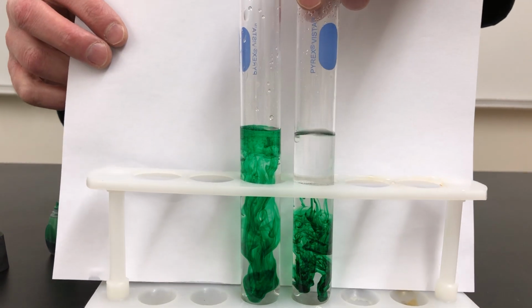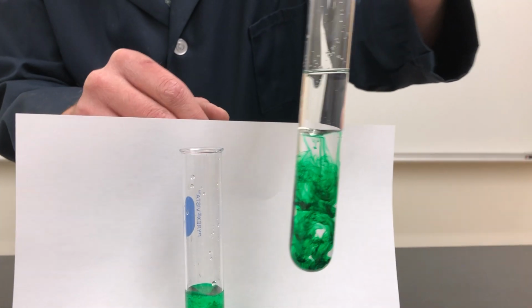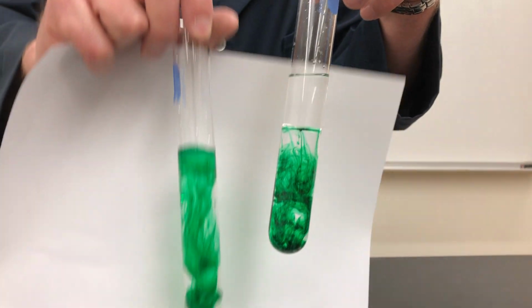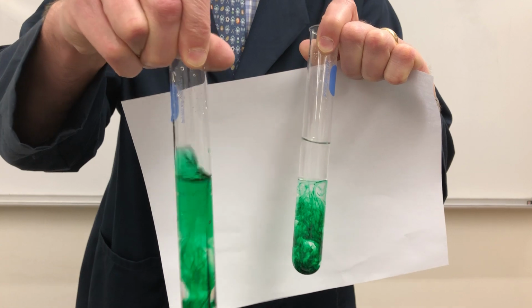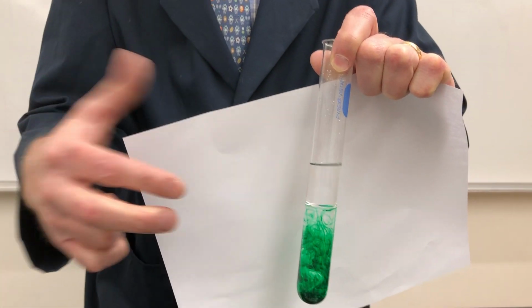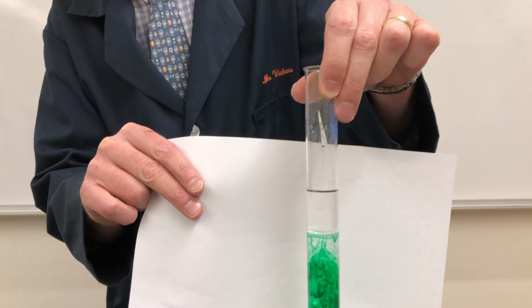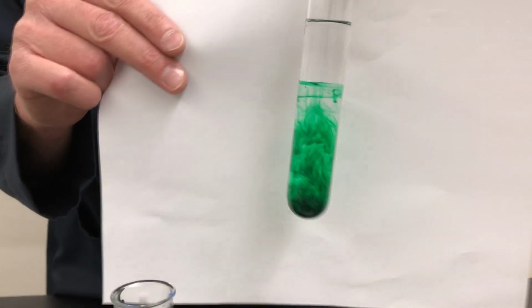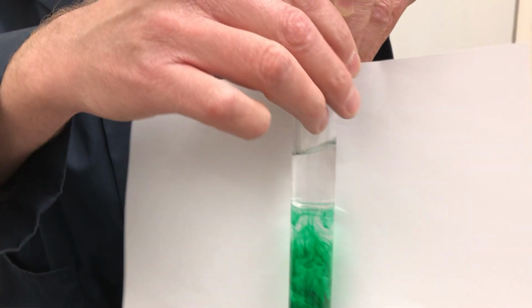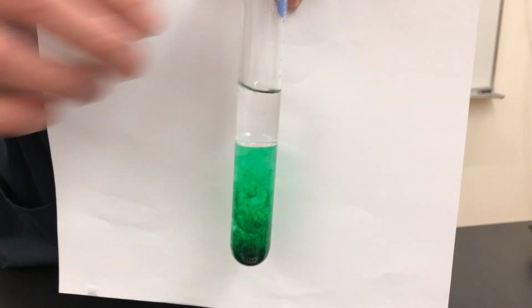Well, you may have guessed that this test tube actually contains two different liquids. So the first test tube, that was just some ordinary water, and as you know, food coloring will mix nicely with water and turn it green if it's green food coloring. This test tube had some hexane in it along with the water, and those hexane and water liquids are sitting in two different layers here. The food coloring skips the hexane layer entirely and goes down to the water layer.